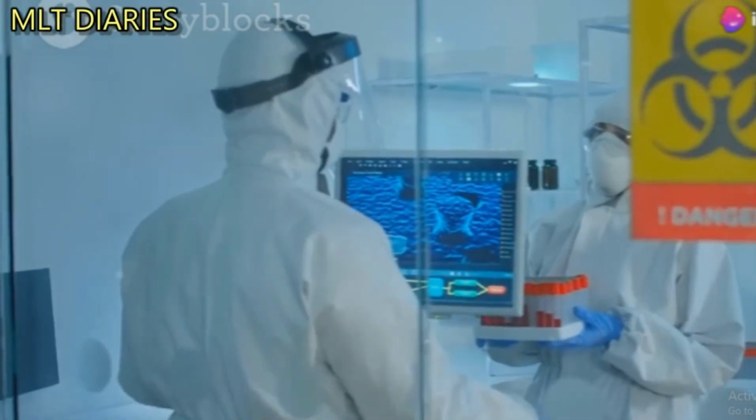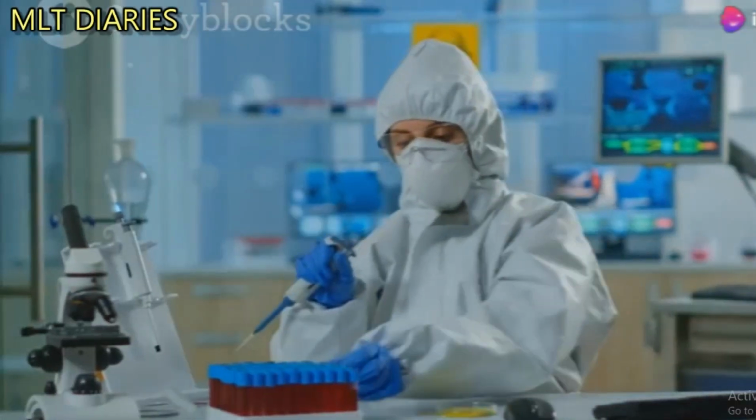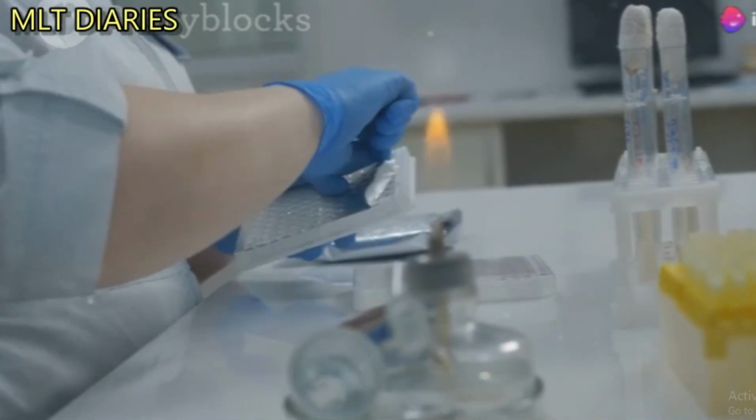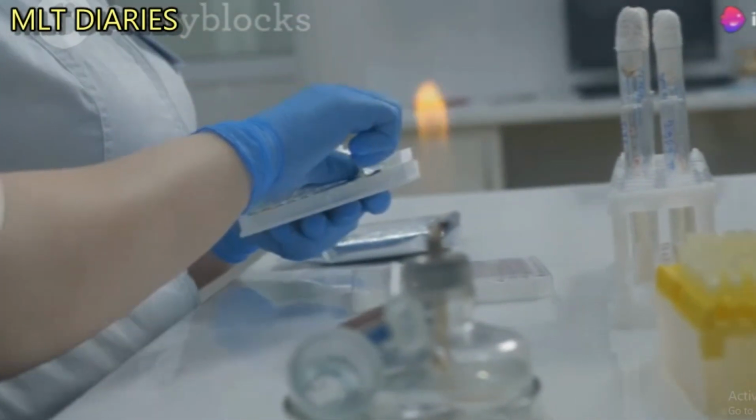Implement safety equipment and practices. Use appropriate personal protective equipment, like gloves, lab coats, and eye protection. Ensure safety equipment like biosafety cabinets, autoclaves, and eye wash stations are functioning properly. Practice good microbiological techniques to minimize contamination and exposure.